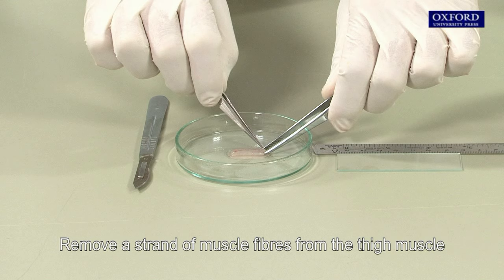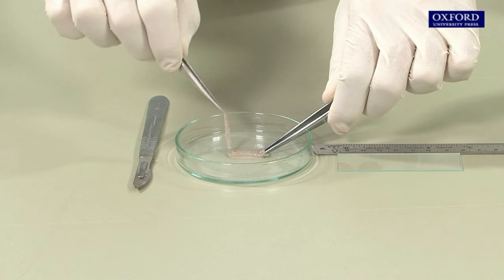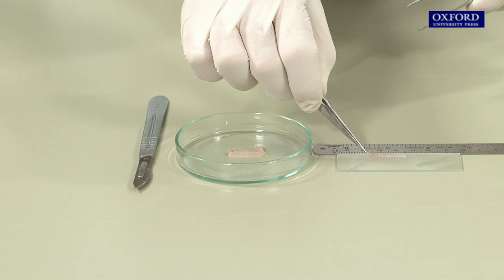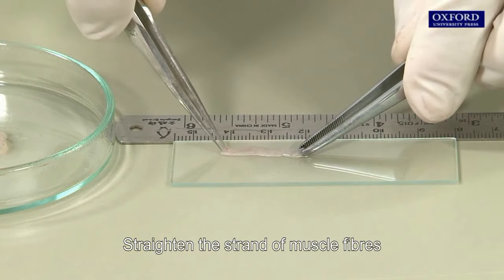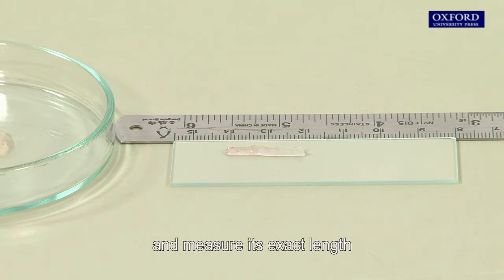Remove a strand of muscle fibres from the thigh muscle and put it on a slide. Cut it to about 2 cm long, then straighten the strand of muscle fibres and measure its exact length.